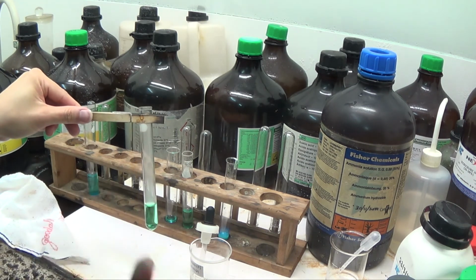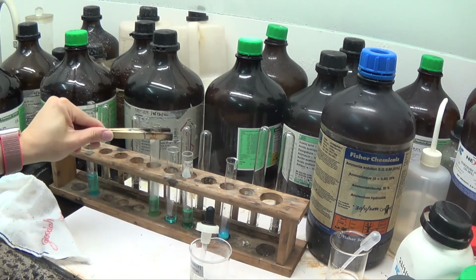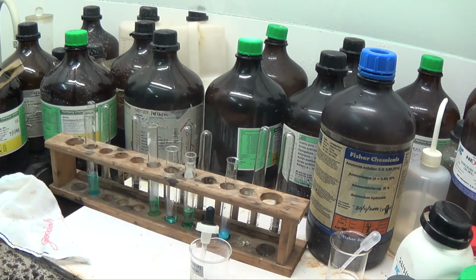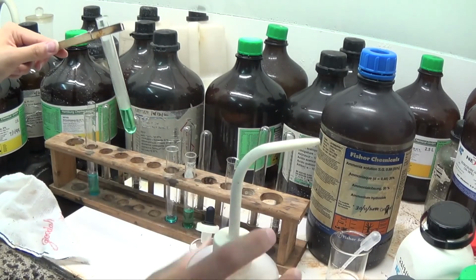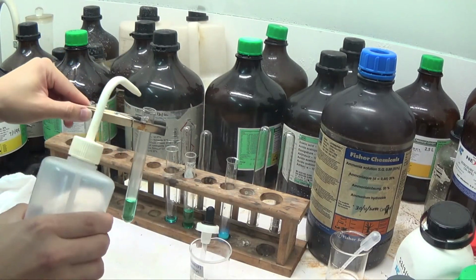So it's a ligand substitution reaction and results in this green color solution, which is essentially copper 2 plus surrounded by 4 Cl minus ligands. Okay, so this is just an example of a ligand substitution reaction, and it's all reversible. So I'm using concentrated HCl, that's why there are fumes all over. By right, it should have a ventilator that's working, so it should all suck the gas properly.